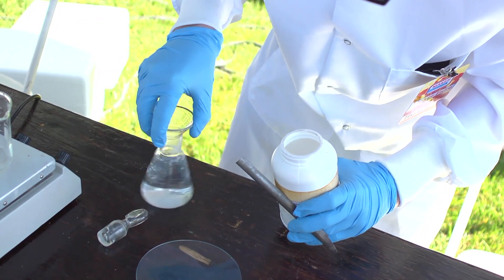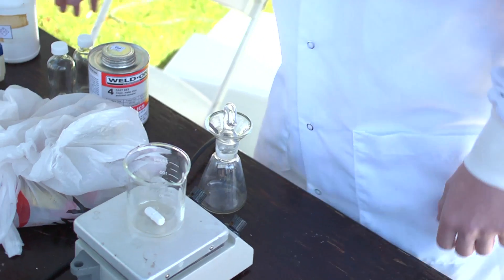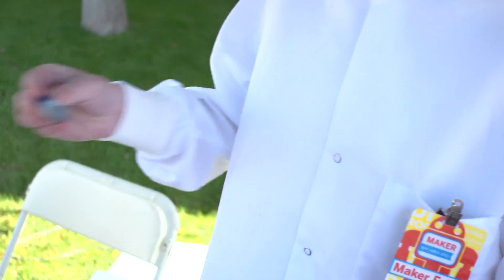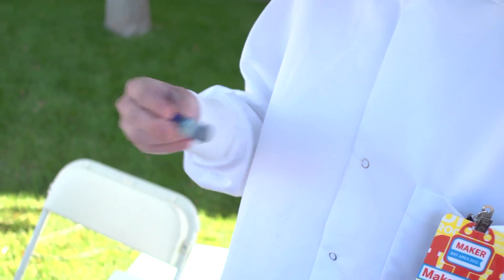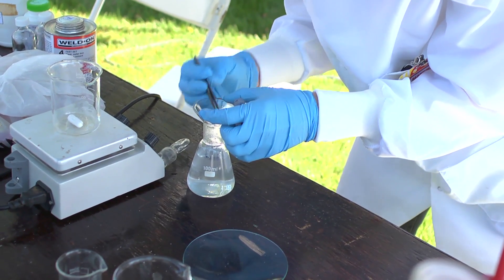Into this flask I add sodium hydroxide and glucose in solution, and that makes a reducing solution. Then I add a dye called methylene blue. Methylene blue is a dye that will turn between blue and white depending on whether or not the solution is reducing. So when I add that and shake it up, it becomes oxidizing and turns blue.